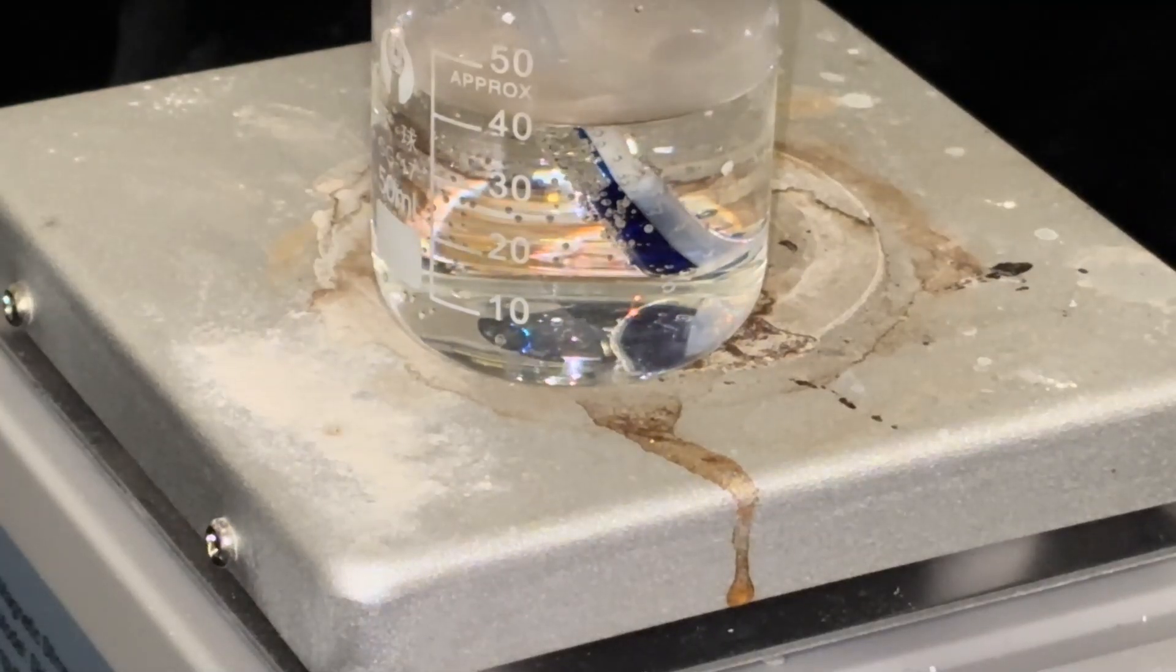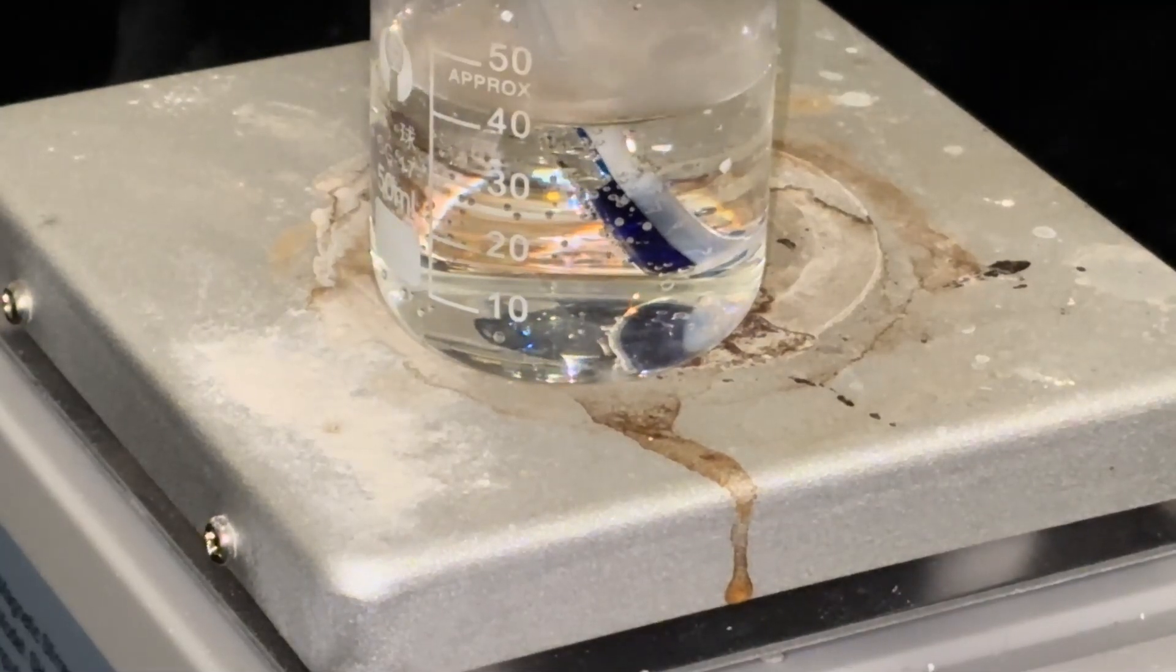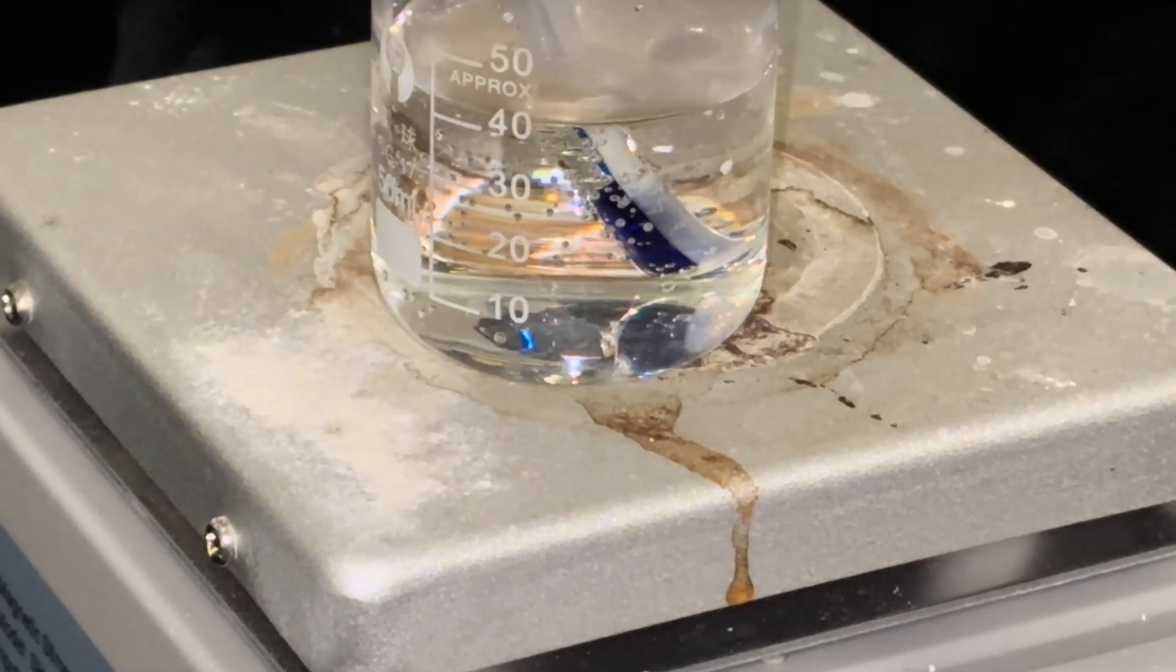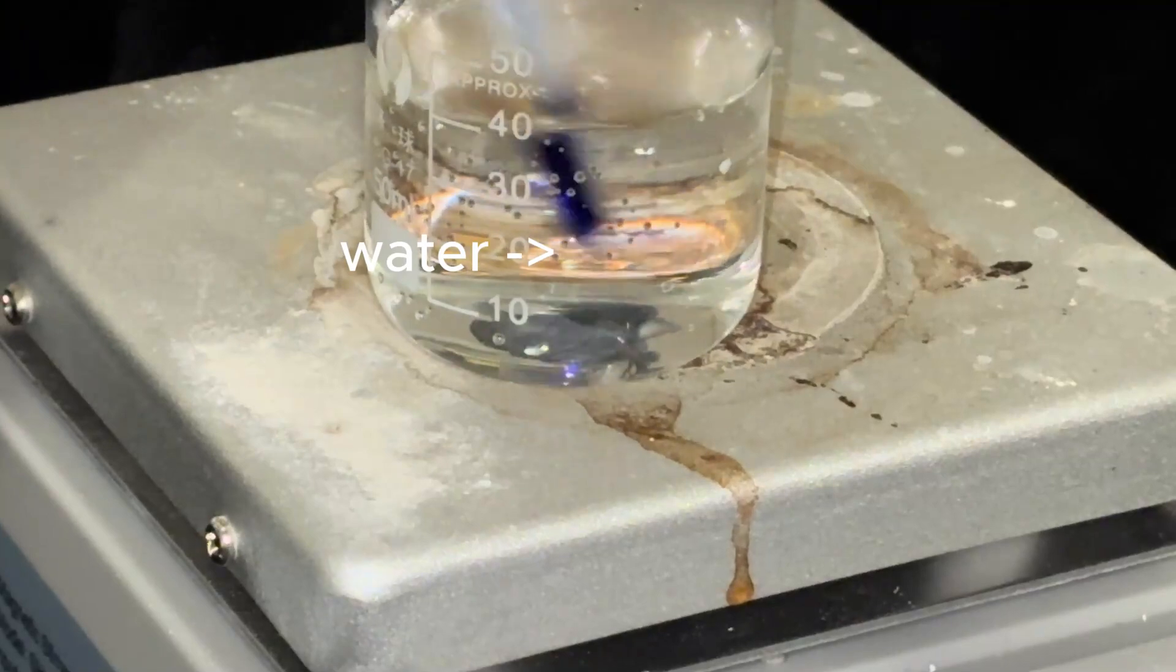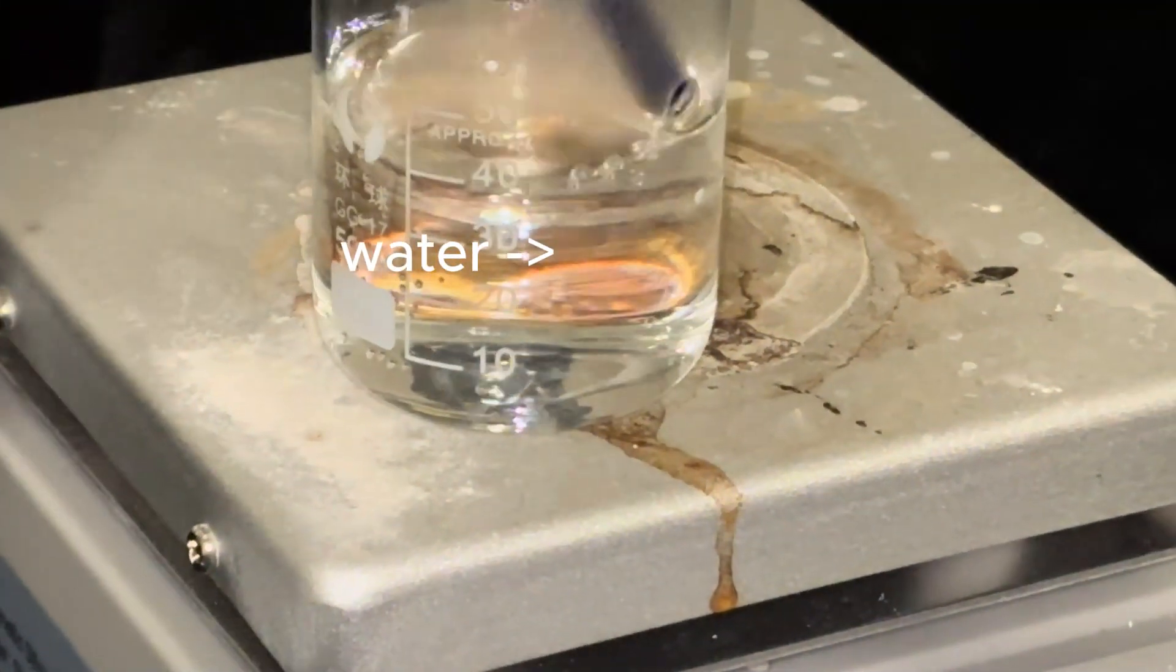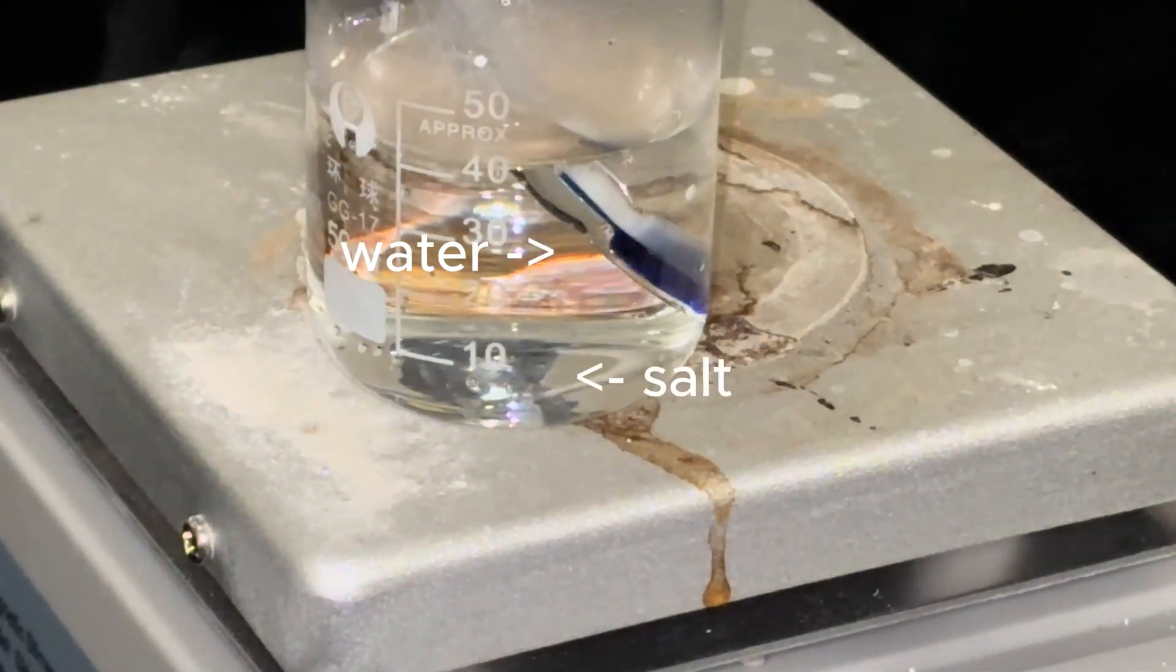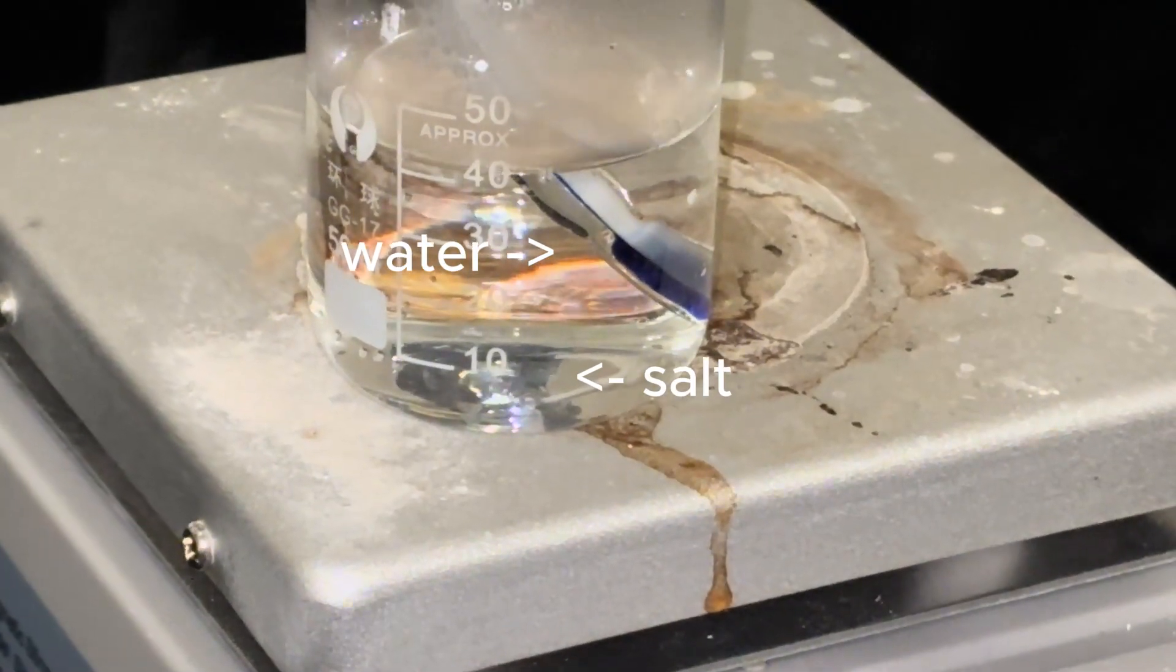After a few minutes of boiling we can finally see something starting to happen. We can see the water evaporating from the solution and some salt particles in there as well.